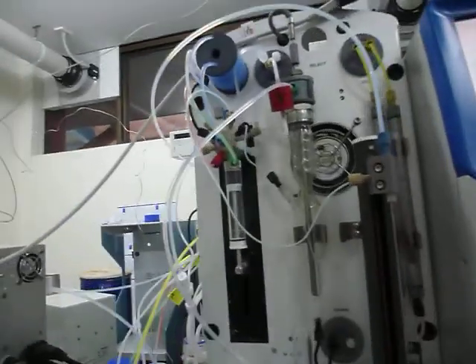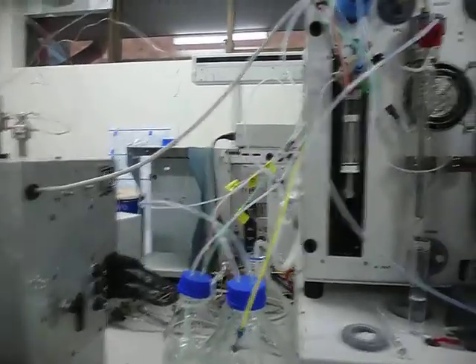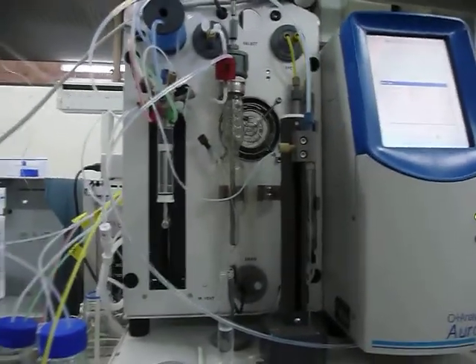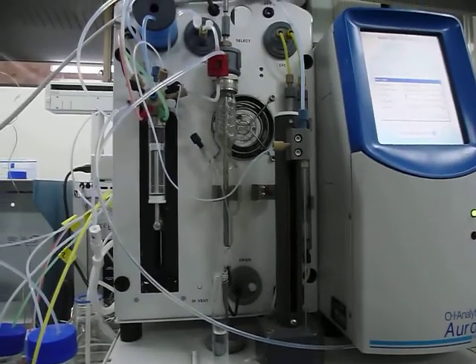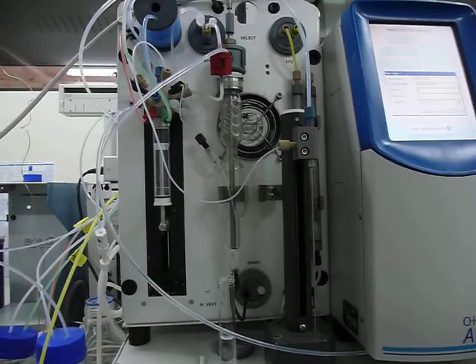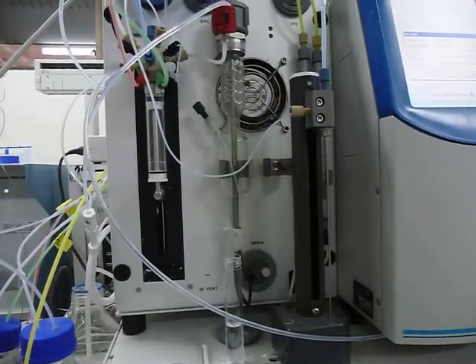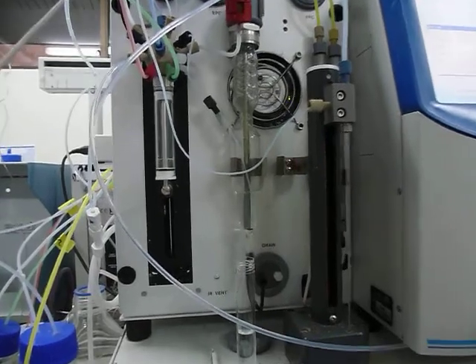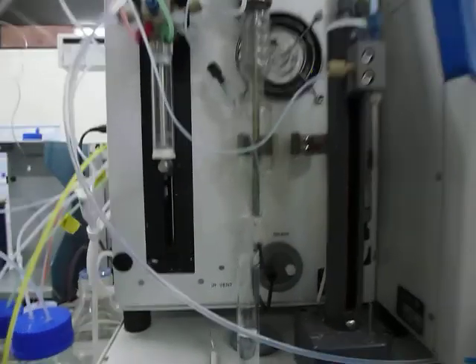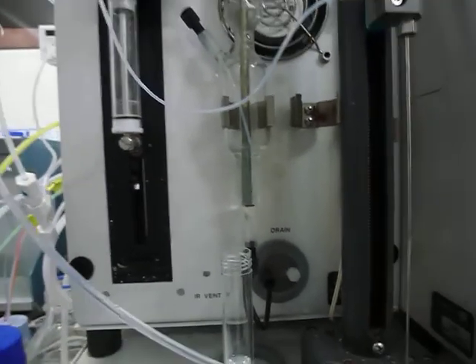and then it takes 1 milliliter of acid that is in another bottle there, and it will pump that inside the reaction chamber here. I don't know if it's possible to see, but there are some bubbles coming out. This is the carrier gas, the helium.